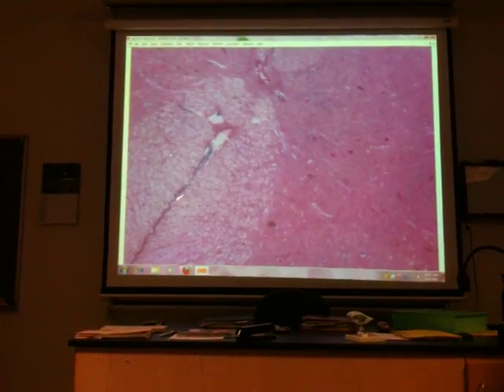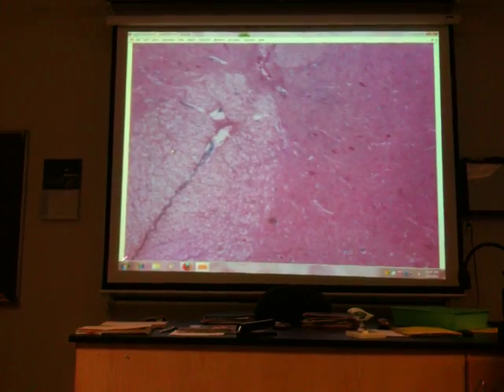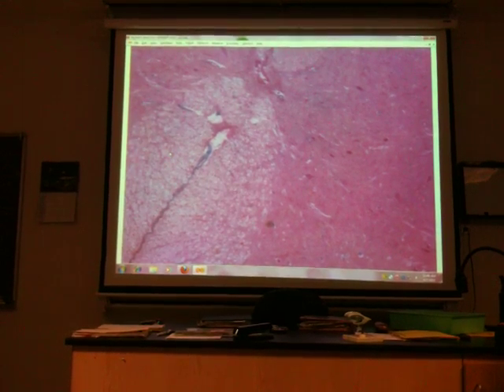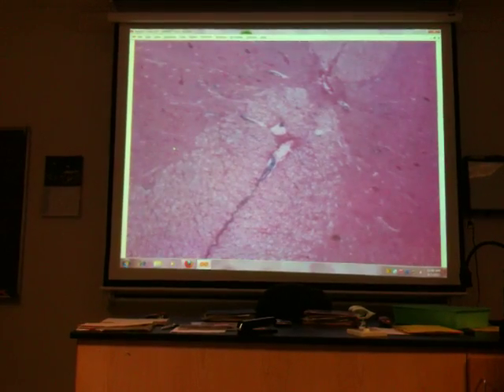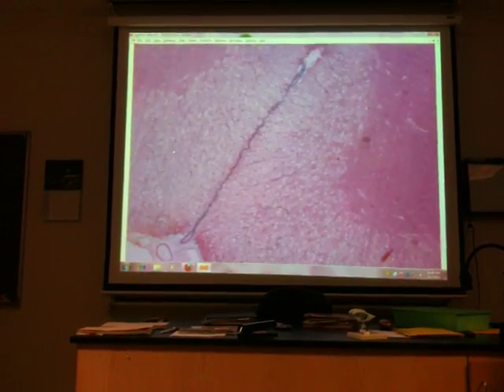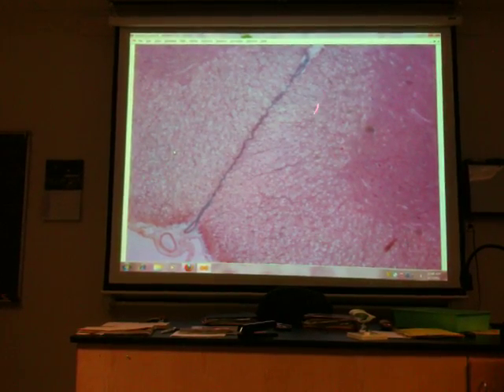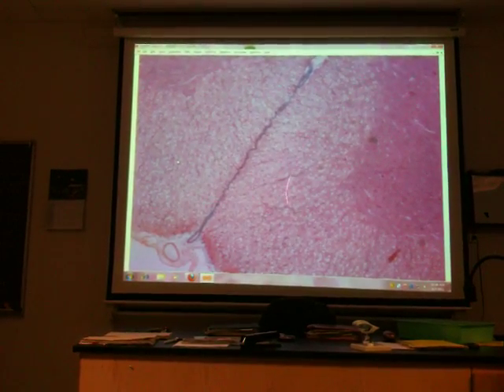So name this feature, this table. Anterior median fissure. Okay, AMF. And now that we know we're on the anterior side of the cord, go ahead and name this structure, this table. Anterior white column. Do you agree, Gretchen and Mark? Yes. Terry and Joni? Anterior white column.